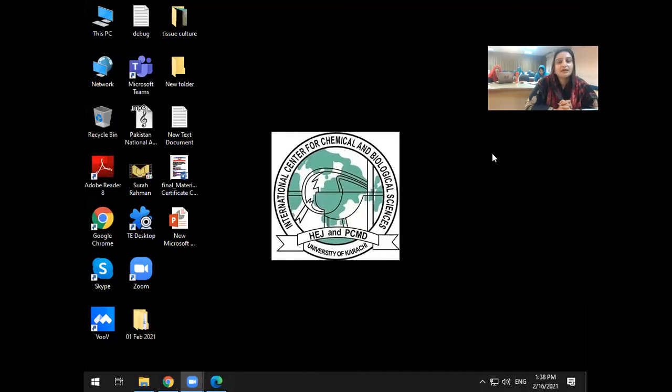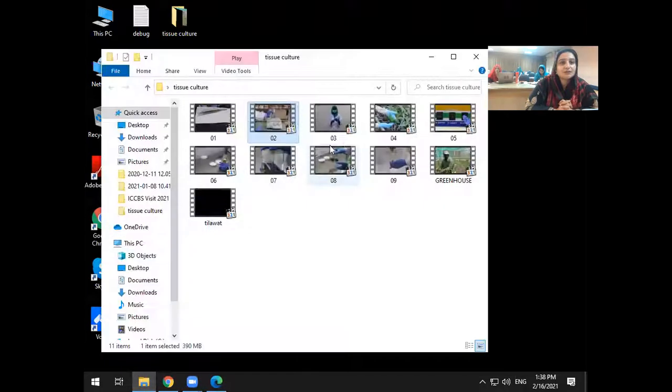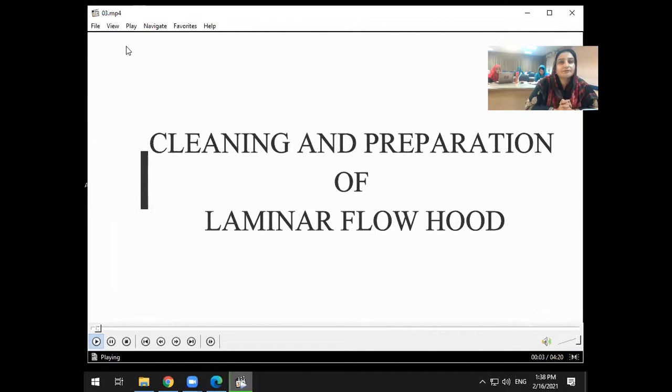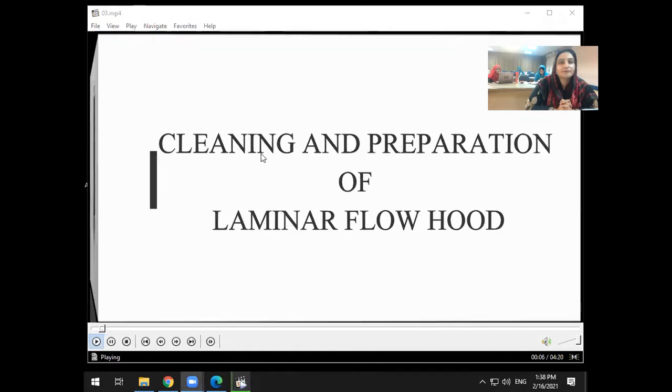Okay, then we proceed now to video number 3. Cleaning and preparation of laminar flow hood.